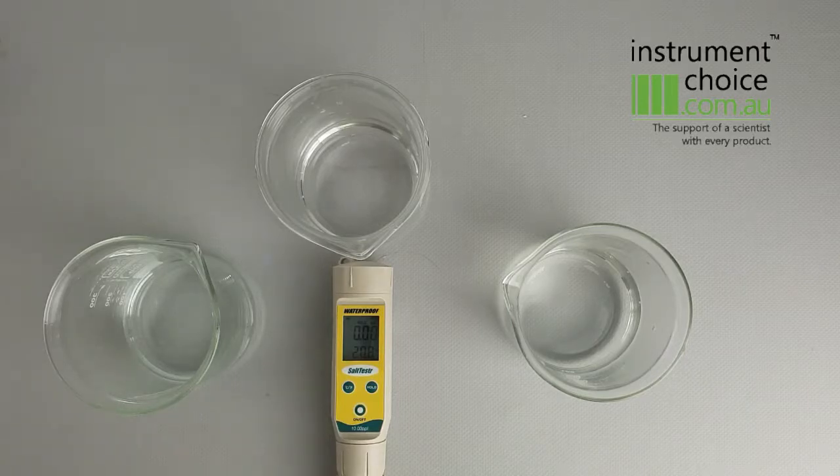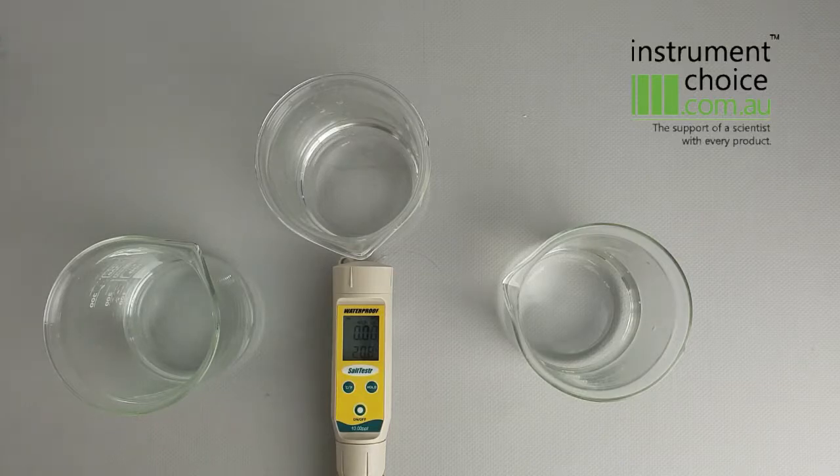When you first get the meter, you need to soak it in some isopropyl alcohol for a couple of minutes. You can get that at your local chemist.